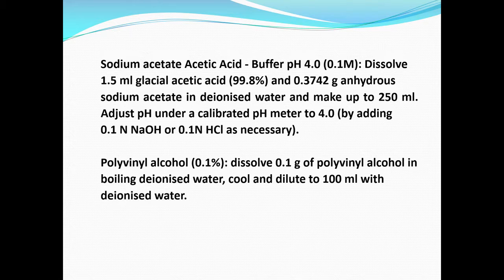Earlier this method worked with an extraction; now we have modified it with an aqueous finish. For that, we have dispensed with the organic extraction reagent, and we are recommending polyvinyl alcohol 0.1% as a stabilizer. Ion pairs are normally stabilized using thick viscous solutions of polyvinyl alcohol, glycerol, glycol etc., and we have found that polyvinyl alcohol is a fairly good reagent. You just have to dissolve 0.1 gram in 100 ml; you have to heat it, otherwise it will not dissolve.